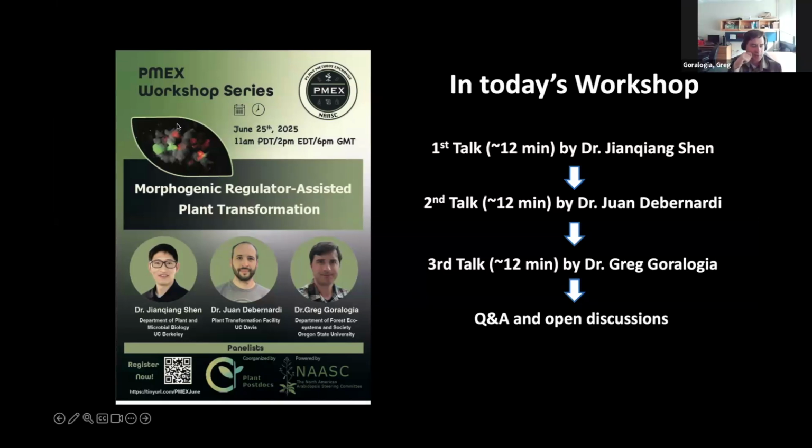Yeah, so spectinomycin, and there are a few others that do this, primarily target plastids. And so if the tissue itself is kind of etiolated, there's not as strong of a killing effect. And for these altruistic approaches, if you need to only select for the cells that get your trait tDNA, but you need to keep the ones that get the morphogen alive for 2 or 3 weeks in culture, then you don't want to kill them too early.